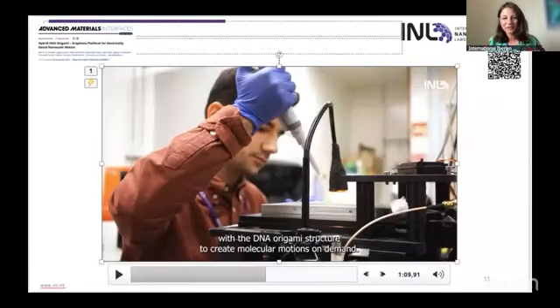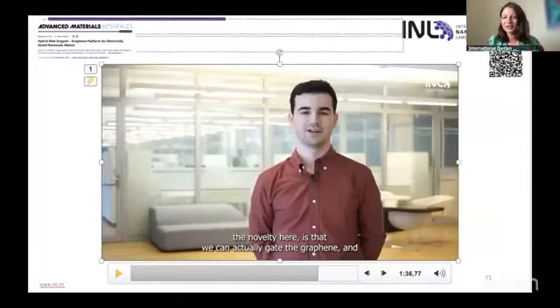And this is work performed at the time by master student João Acevedo, who is now a PhD candidate, who added DNA origami structures to our graphene substrate and now could follow the motions on demand after a gating of the graphene device.